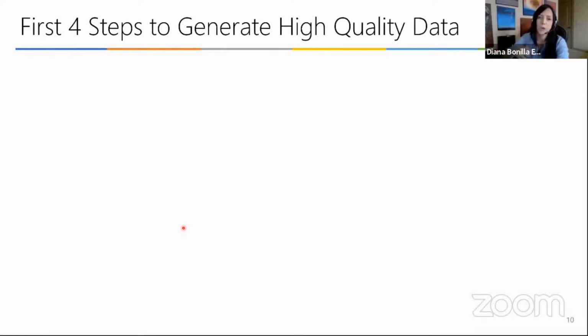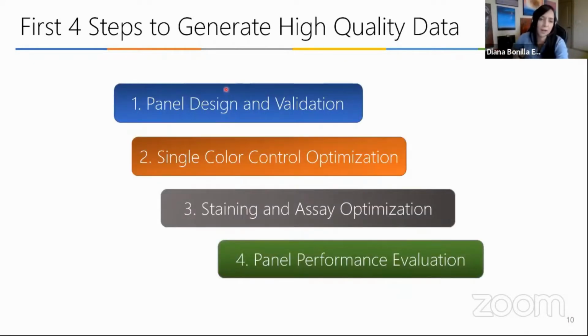So to reach that point where you have good data in order to use any of those computational tools available, you need to start from the beginning. The first step is definitely to have a good panel design.